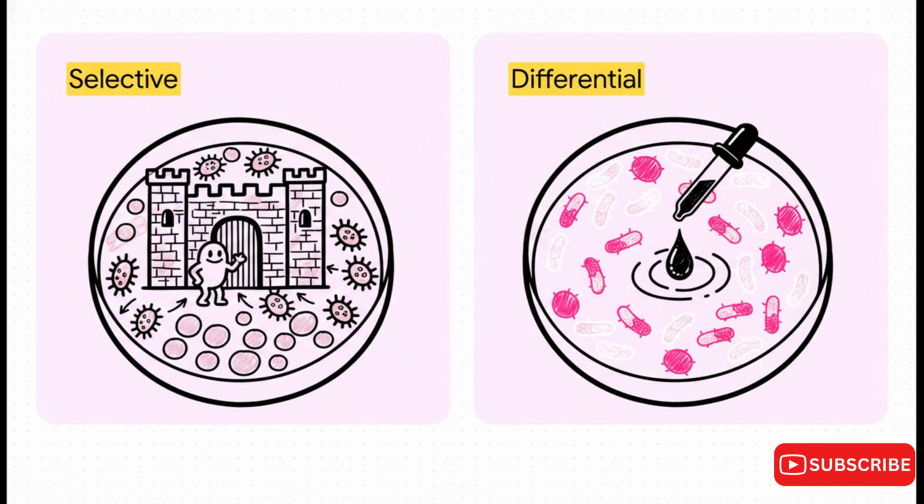Selective media acts like a strict gatekeeper. It actively selects who gets to grow, shutting down all the unwanted microbes. Differential media, on the other hand, doesn't stop growth. Instead, it differentiates how things look once they actually do grow, usually by causing a really dramatic color change based on a chemical reaction. And some media, amazingly enough, do both at the exact same time.